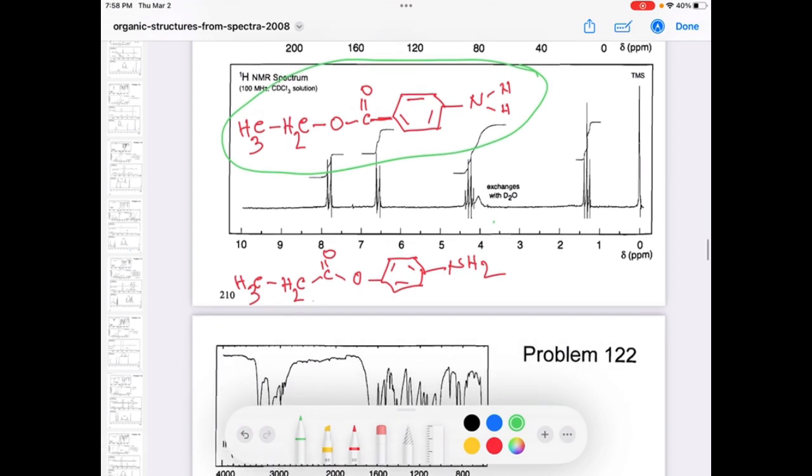So remember, first of all, in the IR, the carbonyl group peak is lower because it is attached to the aromatic ring. And here, the carbonyl group is away from the aromatic ring. So that is one problem. Another problem is in the proton NMR, you see the CH2 peak is above 4.2 or 4.3. That means that CH2 needs to be next to the oxygen. So if you think of the bottom structure, the second structure, then that CH2 is not next to the oxygen, okay? So that is not matching with this. In that case, that CH2 quartet could come up around here.